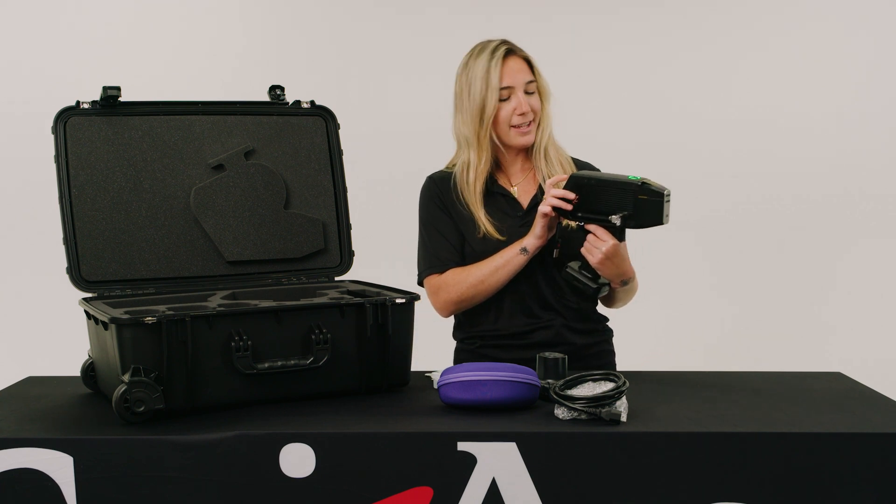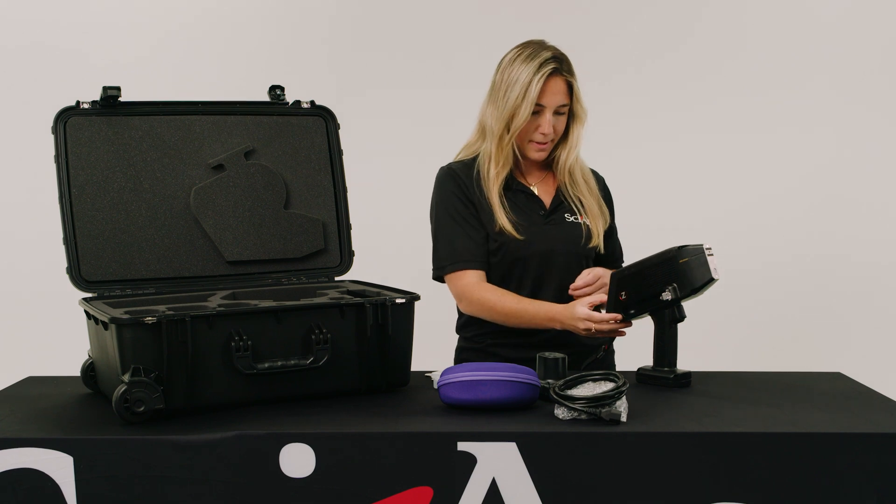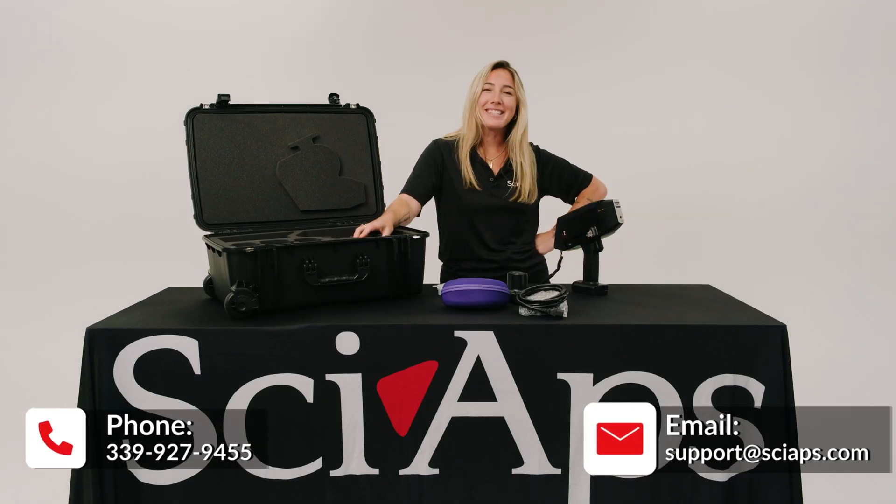You're going to hit Analyze and select your app. Right now it's going to warm up — about 44 seconds left. But yeah, that's how you turn it on.